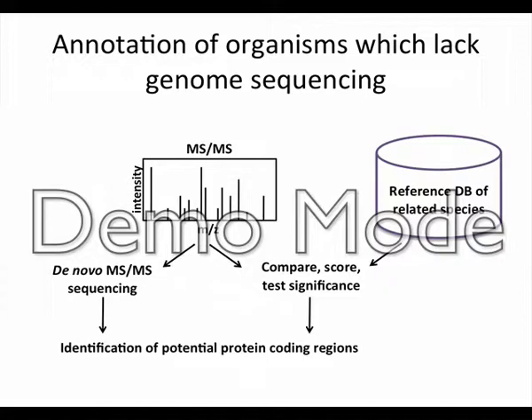Let's say you don't have any genomic data on your species, you can take a related species' genomic data and see what you find from that. So there's an example in the Fenyo lab where they're using the mouse protein sequence database and genome database to try and find things in rat, right? Because there's been way more studies in mouse than rat. So things like that.